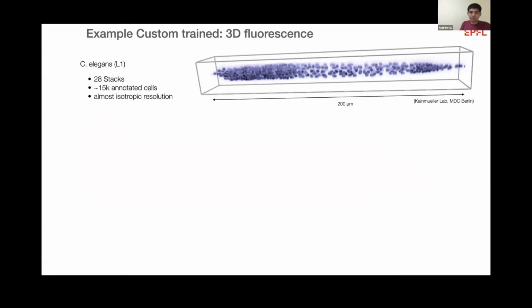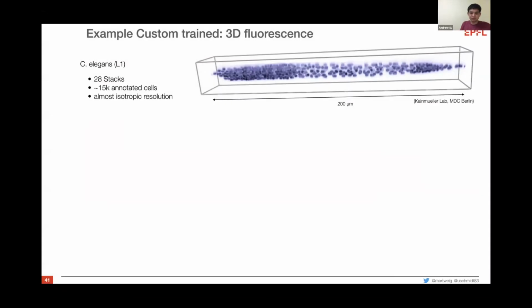So if we have a low resolution image, is it worth upscaling it before we run StarDist, or will it be fine if the nucleus is like 10 pixels wide? That should be fine. So I would not upscale. The only use cases we had where we saw improved results is if you have images that are really like 10-fold less resolved in Z, so everything would be super thin. That is very challenging. And there they upsample in Z and downsample a little bit in XY such that it's more or less a little bit more isotropic than before. This kind of seems to help.